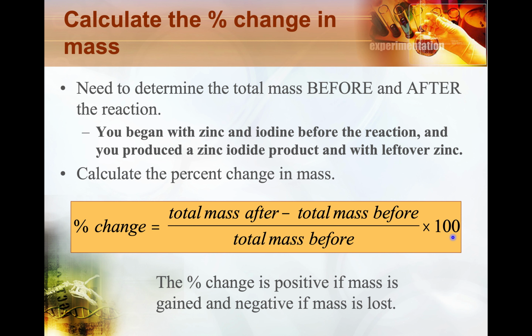The one thing to note is that if the percent change is positive, that means that you gained mass. And if the percent change is negative, that means you lost mass. So it's up to you to consider if that percent change is positive or negative.